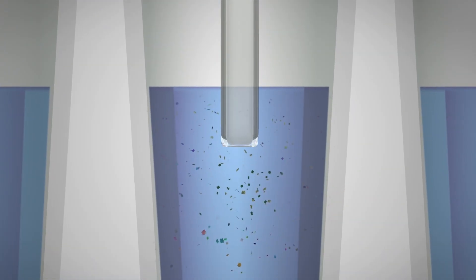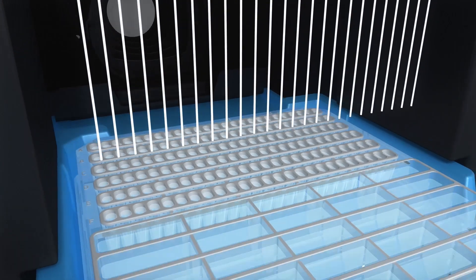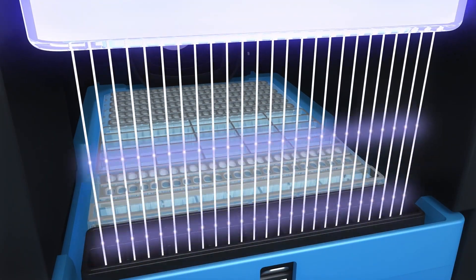Next, your protein lysate is loaded and capillaries are lowered to make contact with the running buffer. Voltage is applied to enable separation by molecular weight.